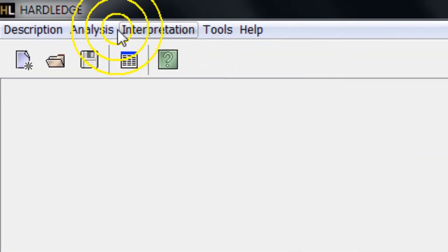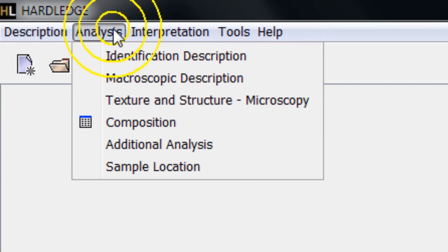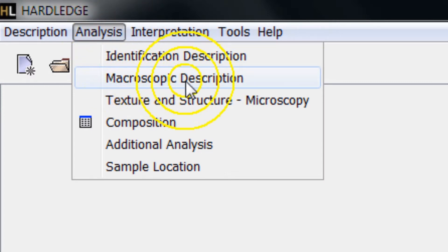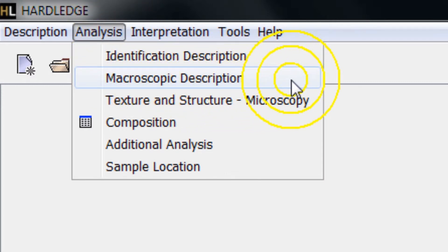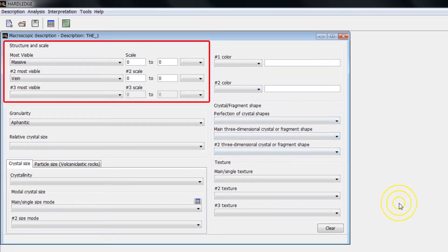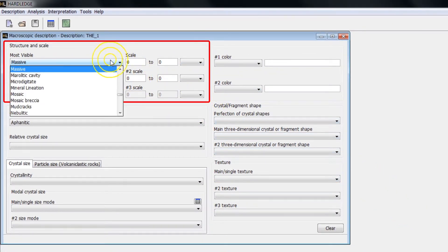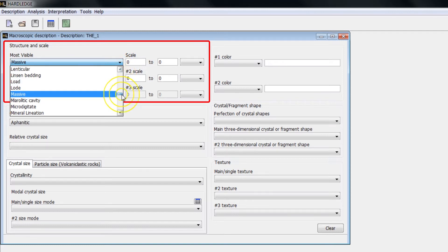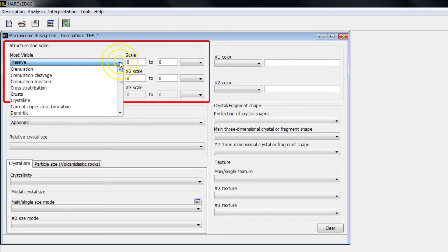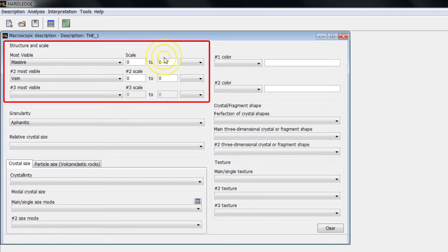For the macroscopic description of the sample, go to the main menu Analysis and then click on the item Macroscopic Description. In Macroscopic Description, you can enter the most important structures using the available list, as well as their respective scales. You can select up to three types of structures in the macroscopic description.